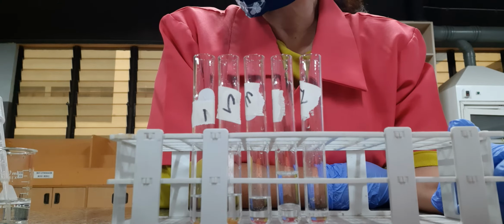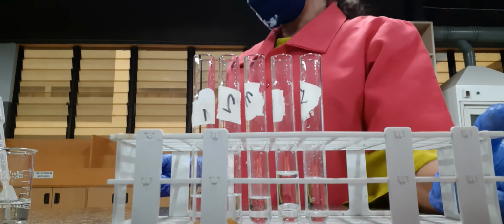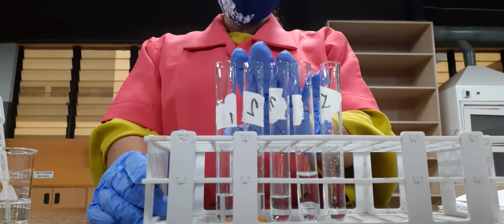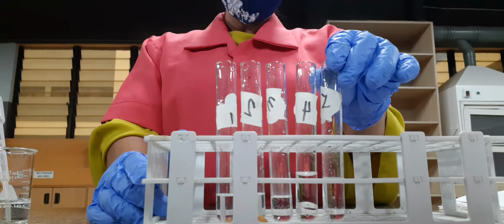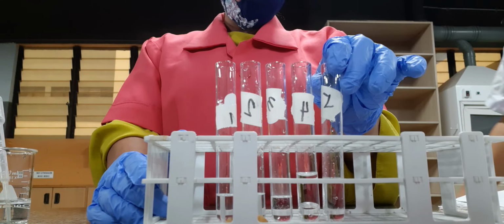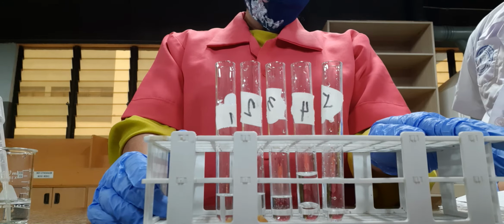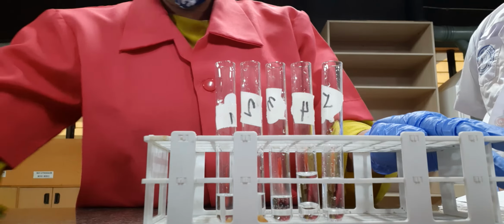So once again, our first substance, number 1, is formaldehyde. Number 2, acetaldehyde. Number 3, acetone. Number 4 is benzaldehyde. And number 5 is acetophenone, which is methylphenyl ketone.